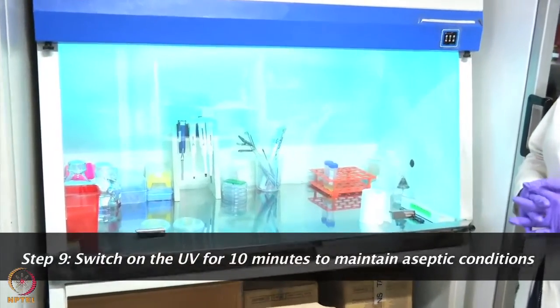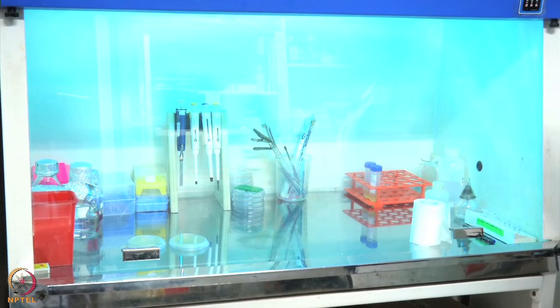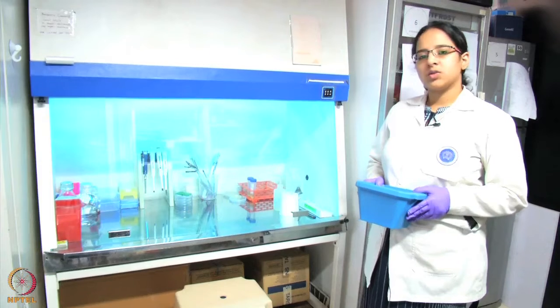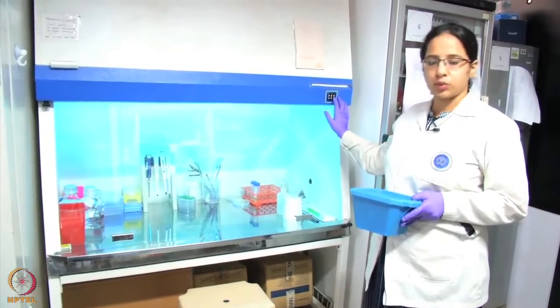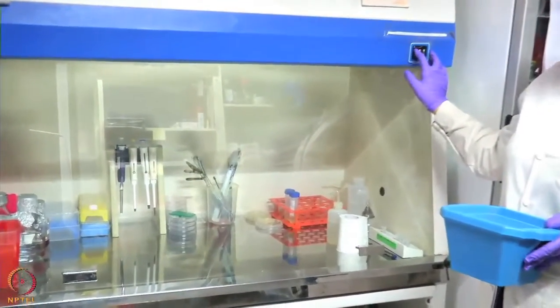This step ensures that inside the laminar hood conditions are extremely sterile and are good for our work. After this, we'll switch off the UV and we'll switch on the fan and the light button.